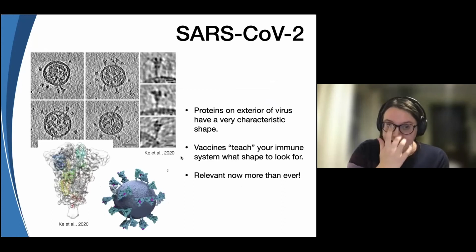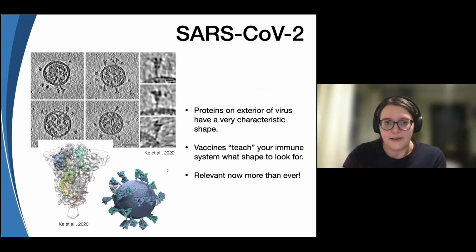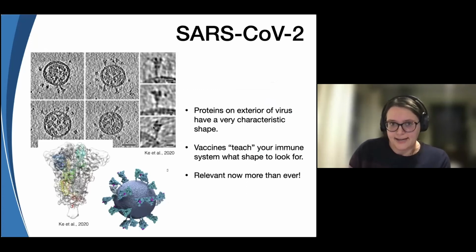This is exactly it, right? So we can take COVID virus particles, disperse them on a grid, freeze them so that we capture all that water, we don't disturb their native structure. And actually in CryoEM, then you can start seeing these little proteins that are stuck on the surface of the virus. And using the exact same techniques that are used for CryoEM to understand that structure and potentially function, you can do exactly the same with the proteins that are stuck on the outside of the COVID virus.